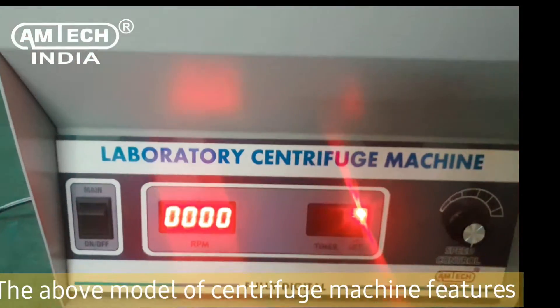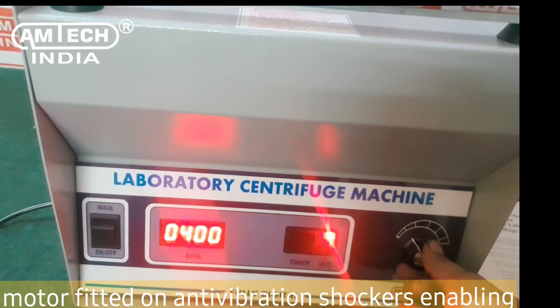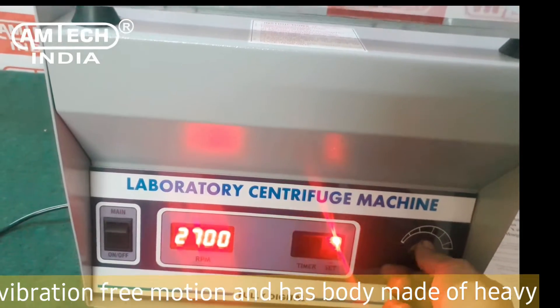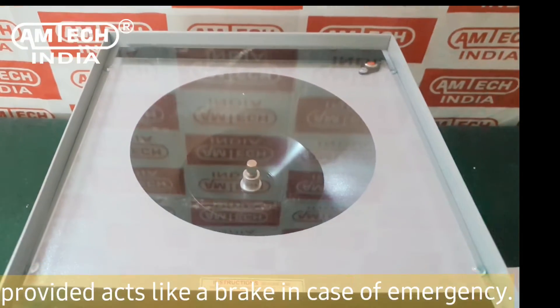The above model of centrifuge machine features heavy-duty 100% copper winding, double bearing, motor fitted on anti-vibration shockers enabling vibration-free motion, and has a body made of heavy-duty mild sheet powder-coated. The limit switch provided acts like a brake in case of emergency.